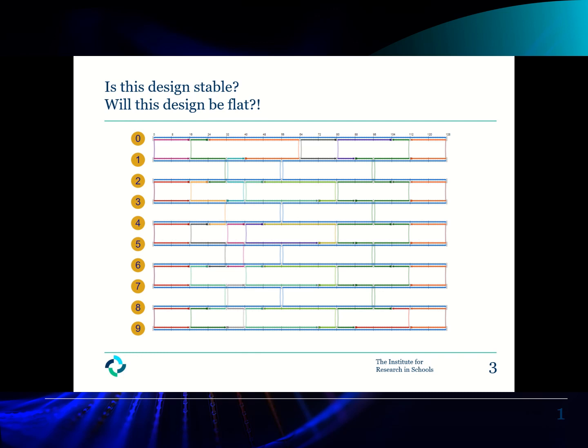At this point, you might want to see how changing the staple routing can have an effect on the design. For those interested, it is also possible to remove the twisting nature of the shape through adding insertions or deletions. The design from tutorial 2, which is on your screen, whilst it looks like a flat design, the way it has been cross-linked has caused a twist in the structure and is certainly not useful if I wanted a completely flat design.